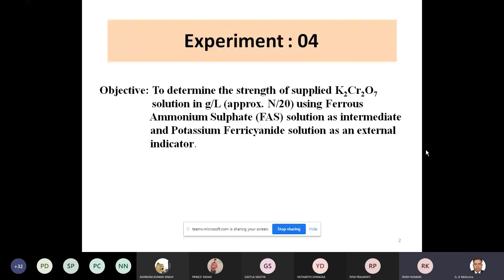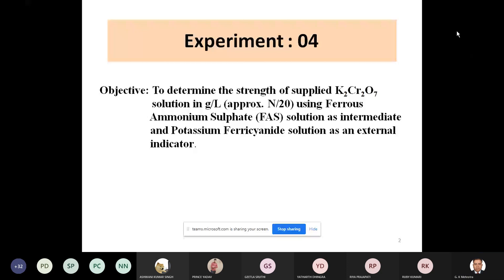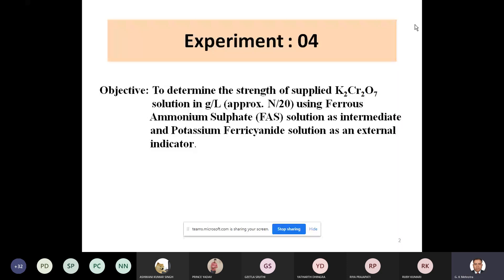This is Experiment 4. In our class, we have merged two experiments of alkalinity into one. This is the well-known redox titration between iron 2 and chromium. Ferrous ammonium sulfate is used as a source of iron 2, and it is an intermediate in this titration.